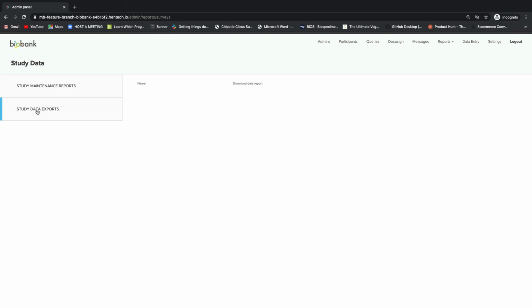If reports have not run yet, new participants or new actions from that day are not expected to be in the report. If a participant joins or completes activities after 5 p.m., for example, they will not be in the report that ran at 5. You'll have to wait for the next iteration. That being said, everything in the participants full view and individual view, so everything in this participants tab that we went over, is in real time. It's only these reports that run nightly.